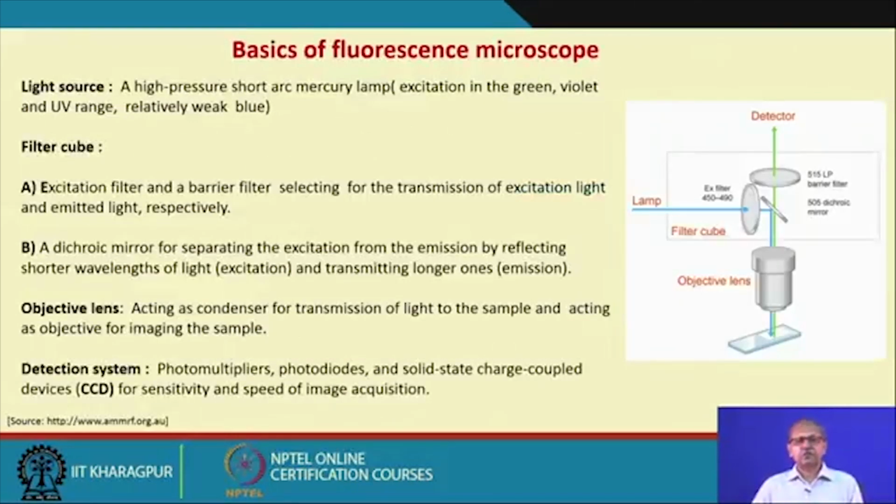So, what type of microscopy shall we be using for that purpose in the microfluidic system? First, we are discussing wide field fluorescence microscopy, and what components are present: the light source, this is the light source.